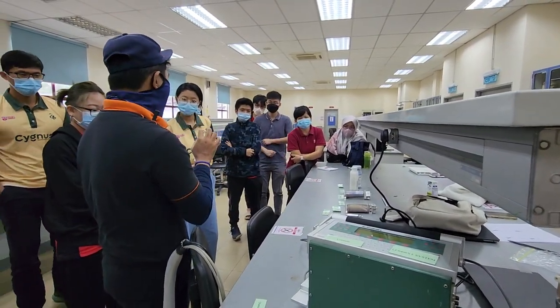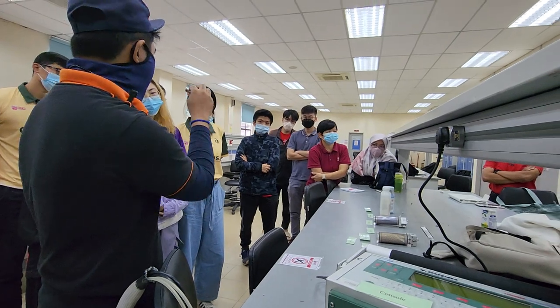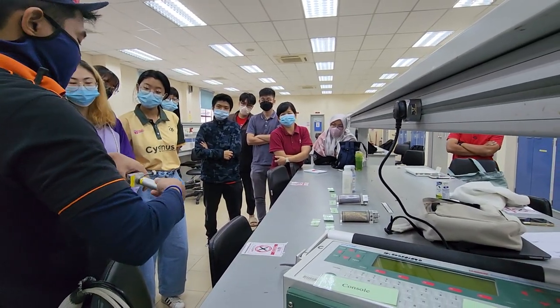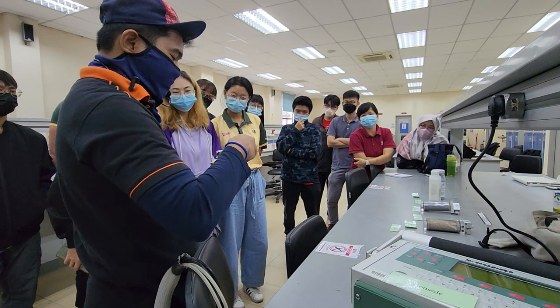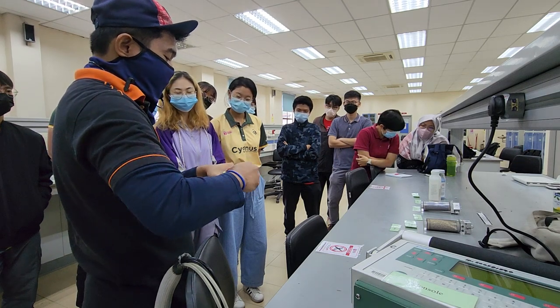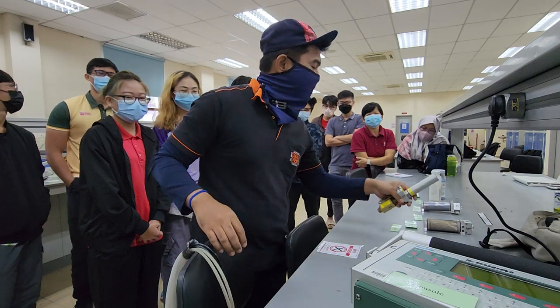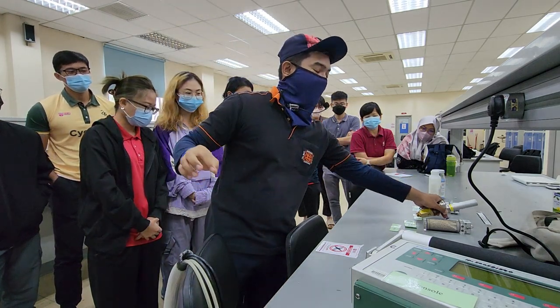This CO2 uses an external source, a little CO2 canister like this. So we open this. If you ever played paintball, this is the same thing that you use to shoot at your friend. Ever played that? It's not dangerous, it's just very hurtful, and hateful, because in the game you know actually who likes and who doesn't like you. I don't know whether in Malaysia they have it or not. This is how it's fixed. This is not completely tight. We'll do it in a bit.